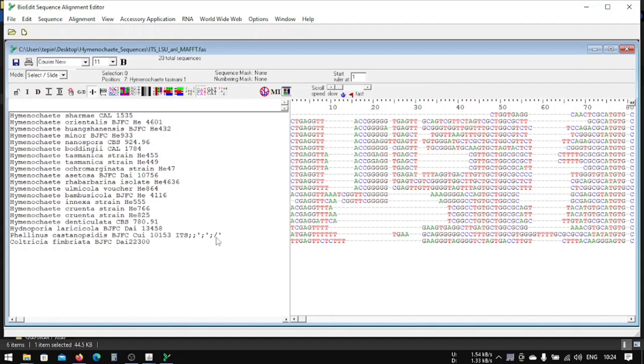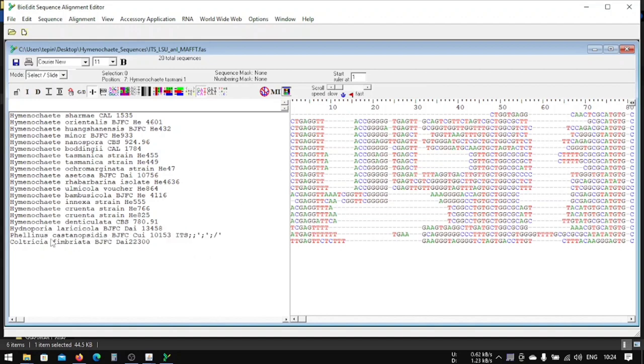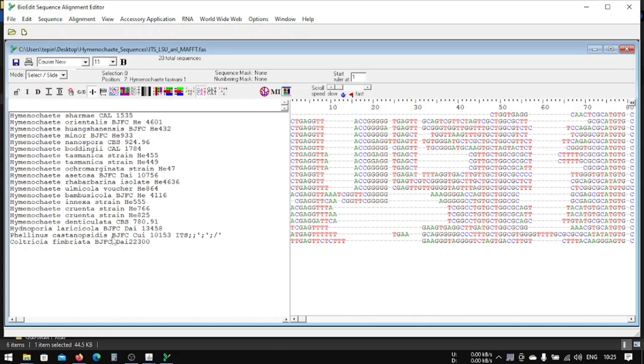It must be something like, I don't know how long is it. One, two, three, four, five, six, seven, eight, nine, ten, eleven, twelve, thirteen, fourteen, fifteen, seventeen, eighteen, nineteen, twenty, twenty-one, twenty-two, twenty-four, twenty-five. So if it's twenty-five here, it must be around fifteen we can say that.